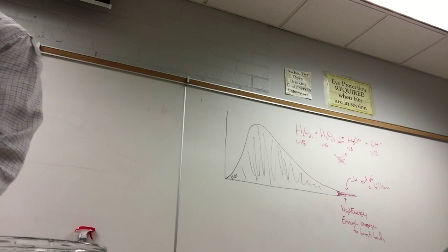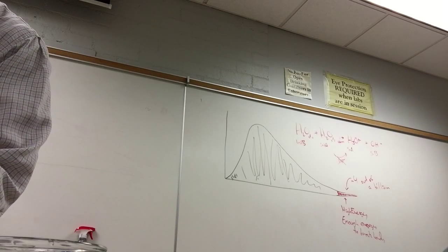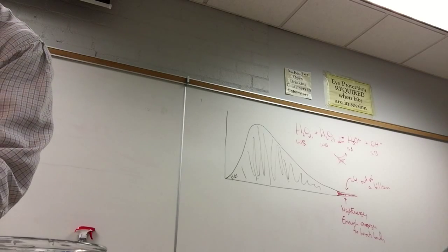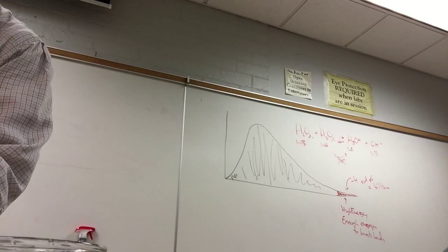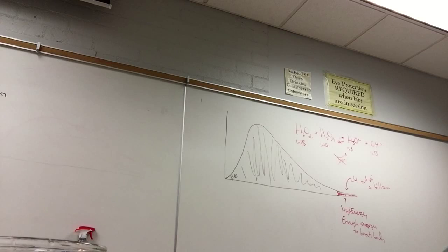This is like, how did we free up the sulfate in our unknown? Well, we dissolved it. And so let's just dissolve this. There we go. So add a little bit of water here. And you got it. And so now we have mobility. So it's a good conductor.